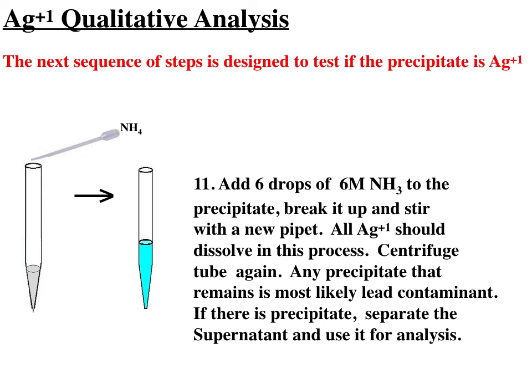I have the remaining precipitate from that, and to that I'm going to add 6 molar ammonia, and then I'm going to break up the precipitate with a pipette, and I'm going to dissolve all the precipitate. So I'm going to take what was a solid and reconstitute it as an aqueous solution with the addition of ammonia in this particular step.